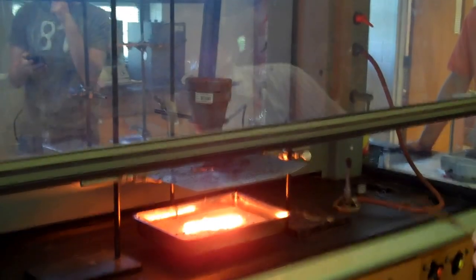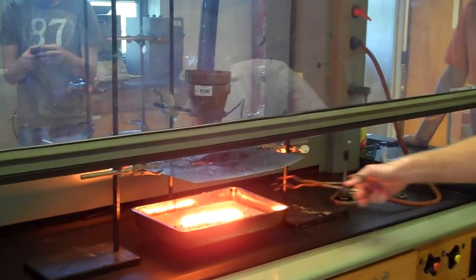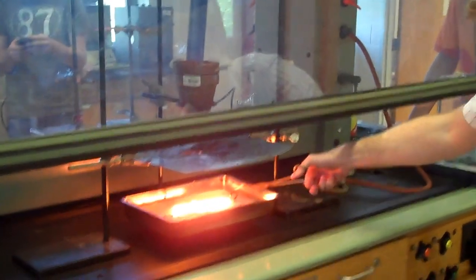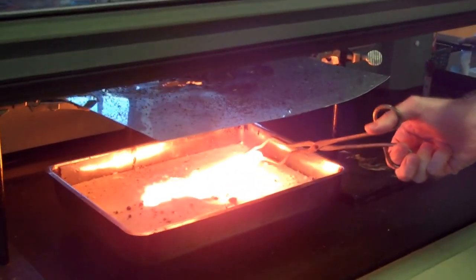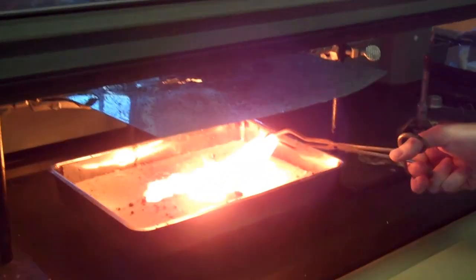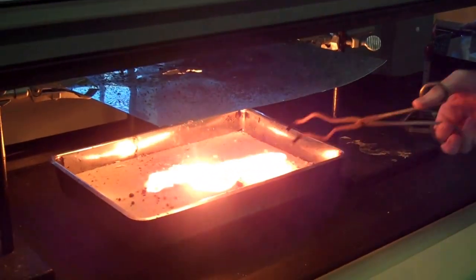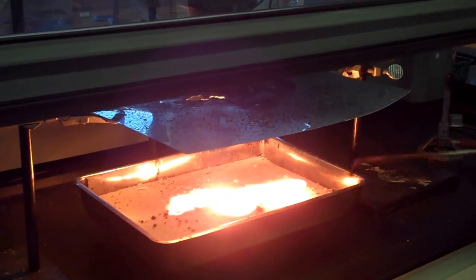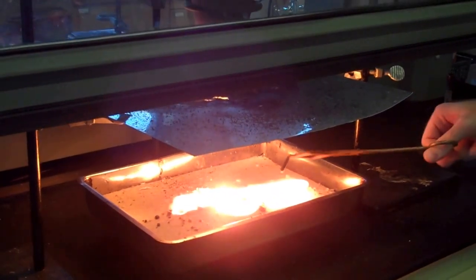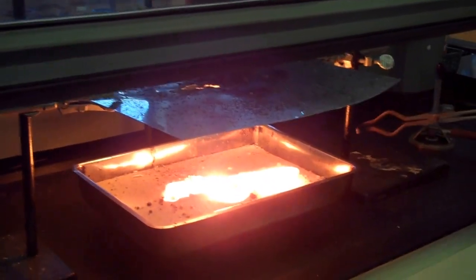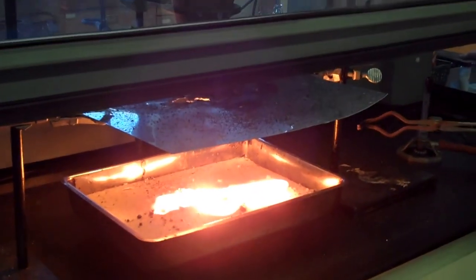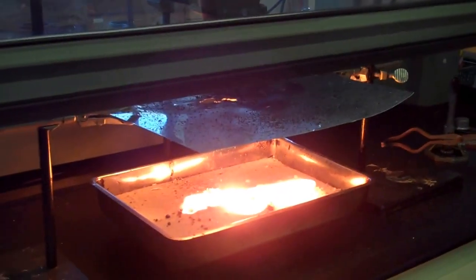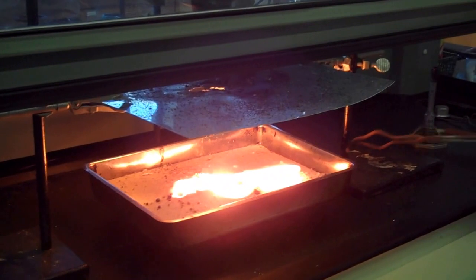The cool thing is you can kind of see the liquid? That's the liquid iron. It's just pouring out of this shell, basically, into the sand. So that's pretty awesome.